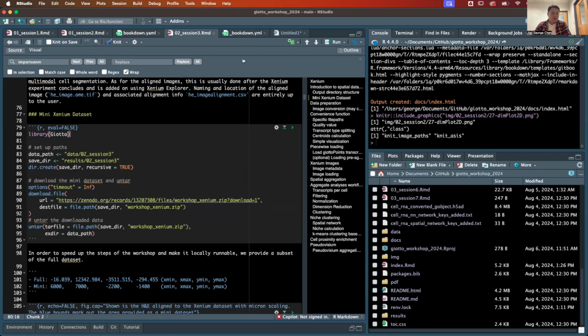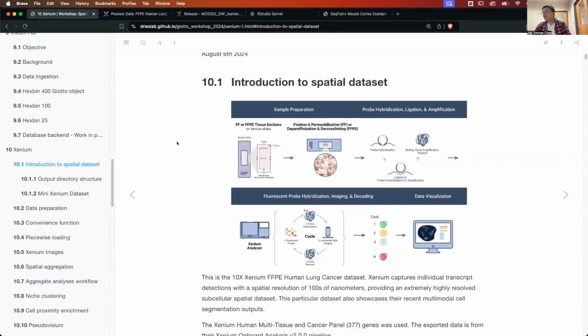Anyways, back to the description of Xenium and this particular data set. So Xenium is 10x's in situ platform where you start with the slide very similar to Visium, except after you place the tissues, you first do a fix, and instead of also digesting that tissue somehow to get the RNA to all fall out onto a capture lawn, with Xenium instead you have padlock probes that come out. So you have the RNAs that are living inside of your tissue.